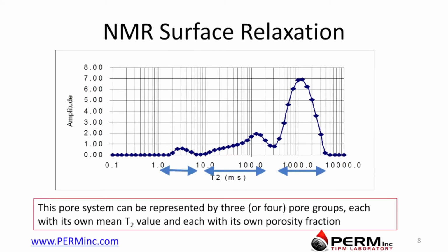On the other hand, we have something like a low viscosity water. So water has a very slow bulk relaxation time because it's got a low viscosity. Its molecules are far enough apart that they can move around for a while before they contact each other. If instead we take that water and we put it into porous media, the other thing that can happen is that the molecules, instead of banging into other molecules of water, they can bang into the walls of the porous medium and give off their energy to the walls. And this is what we call surface relaxation.